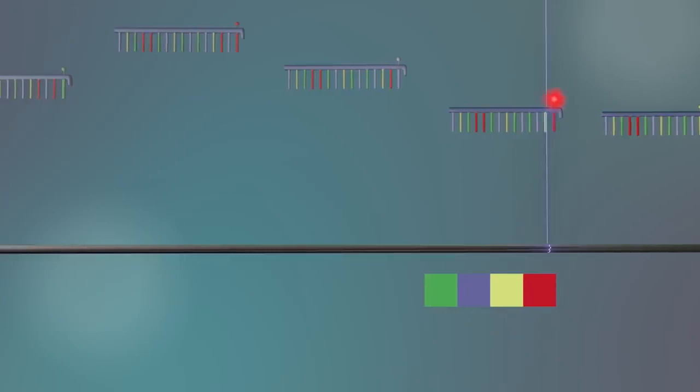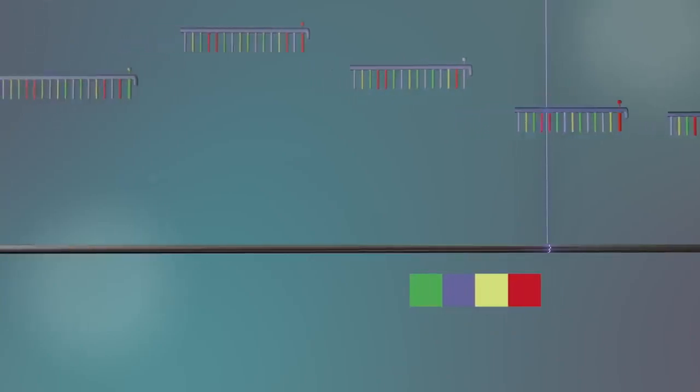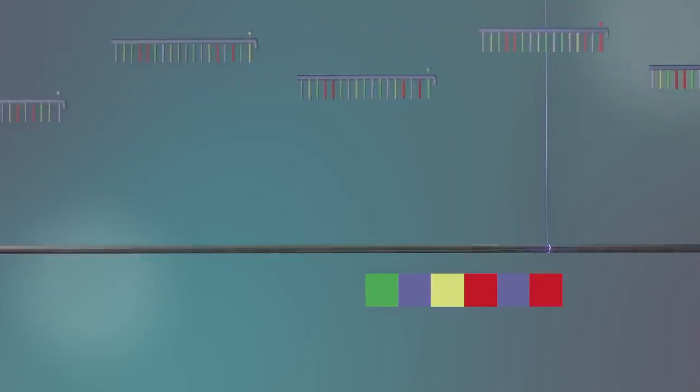The shortest DNA fragments will be read first and the longest read last. The sequencing machine records the colour of the terminator bases as a series of coloured blocks. Each coloured block represents the labelled terminator base at the end of each fragment of DNA.